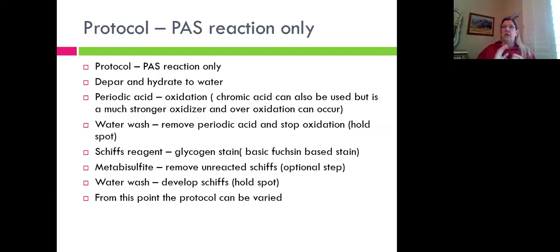So also remember that in a pinch, it is not preferred, but in a pinch, you can use chromic acid as a replacement for the periodic acid. But there are consequences to that. And the consequences are that the chromic acid is a much stronger oxidizer.